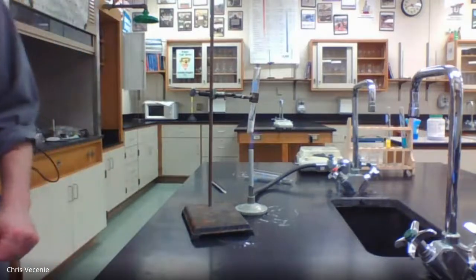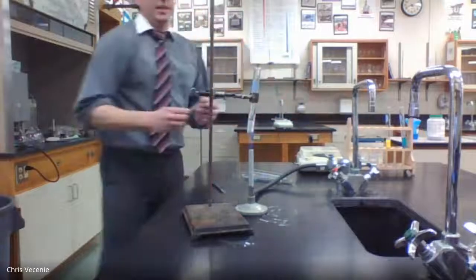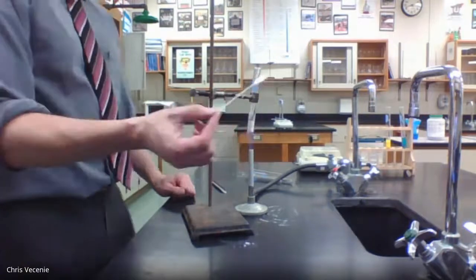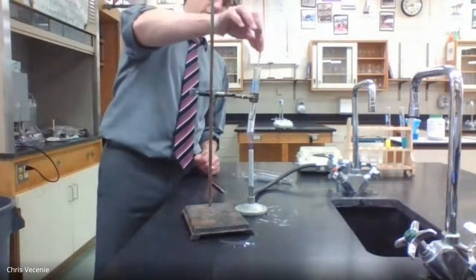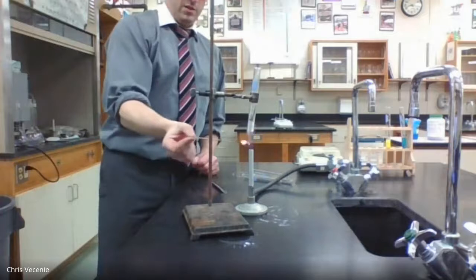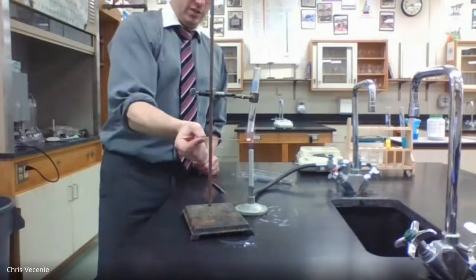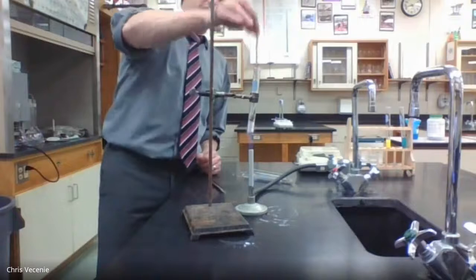All right, so there's our 5 minutes. Now I'm going to let it keep burning, but what I'm going to do is light my wooden splint, and I'm going to insert it into this without touching the bottom. Again, do this a couple times. On fire, and it extinguished. On fire, and it extinguished.